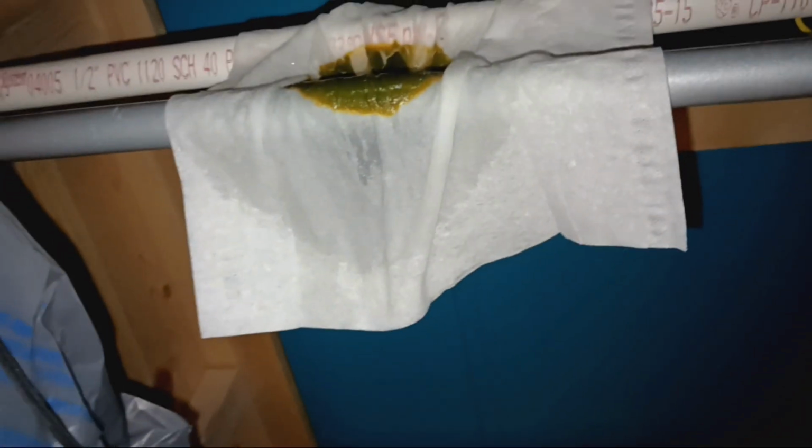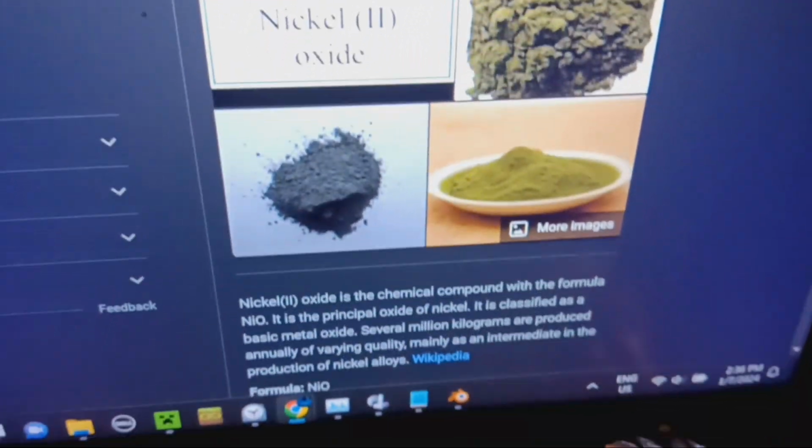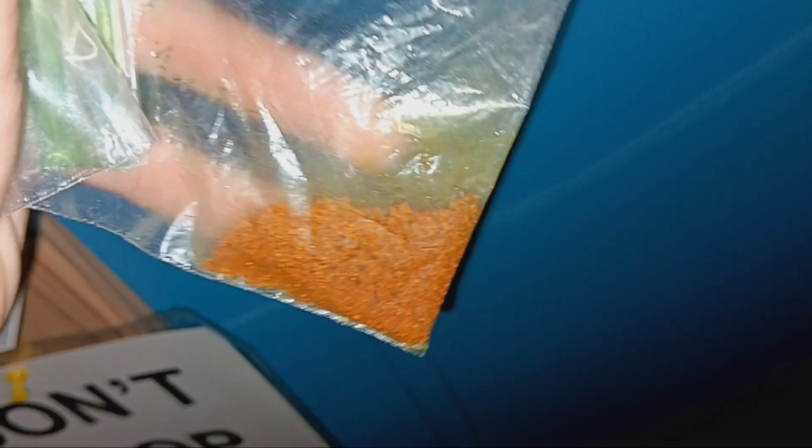So, we've succeeded today. Like I said earlier, the tissue was attempting to steal the iron oxides. I could not have this. As a result, I opted to dry the iron oxides on aluminum foil. I now use a method for drying things on plastic bags instead, as it is much better to do so. However, the aluminum foil did not affect the results, but caused us a bit of a loss in yield, as it decided it would steal some of the dust that was very fine.